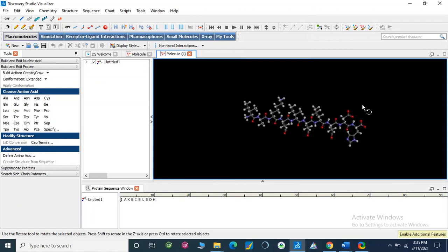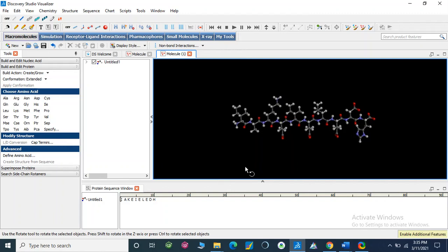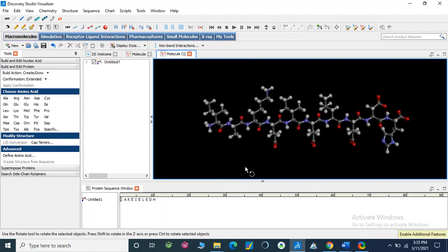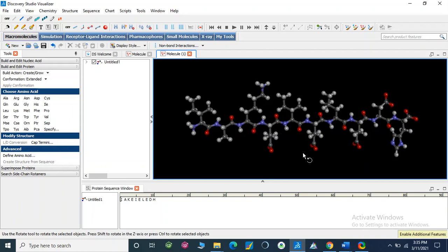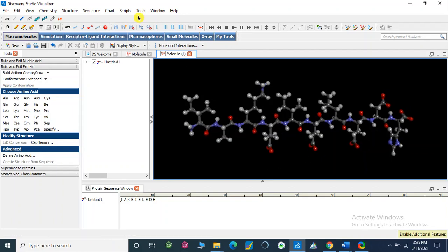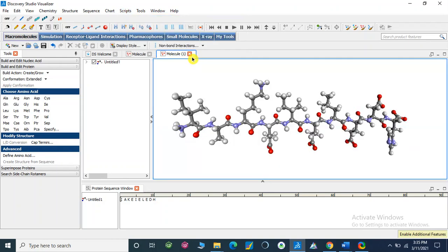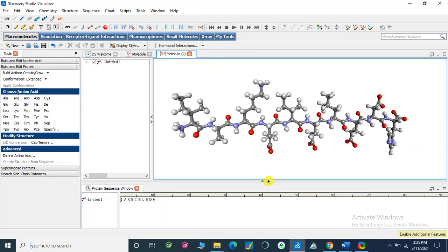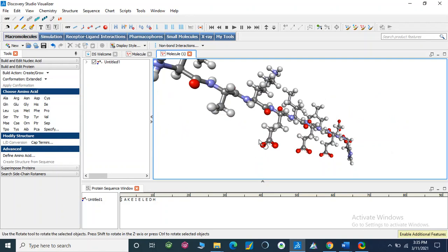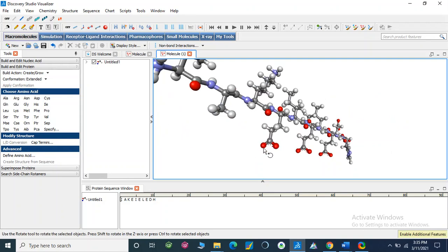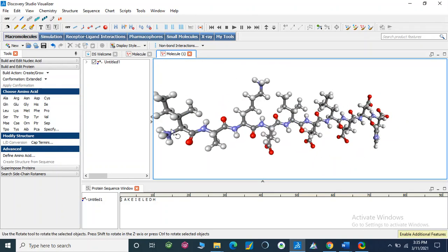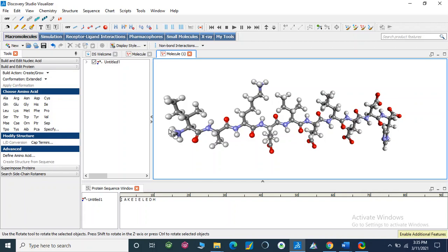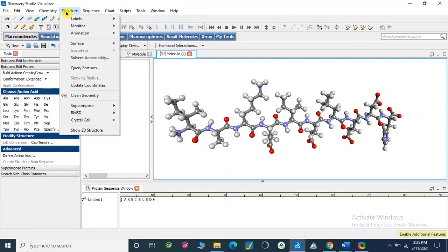Now, I am going to make it in publication quality so it can be clear. If you look at here, it shows partial double bond. We can remove this partial or we can localize double bond from here, so bond, localized bonds. Okay, now the bonds are localized.